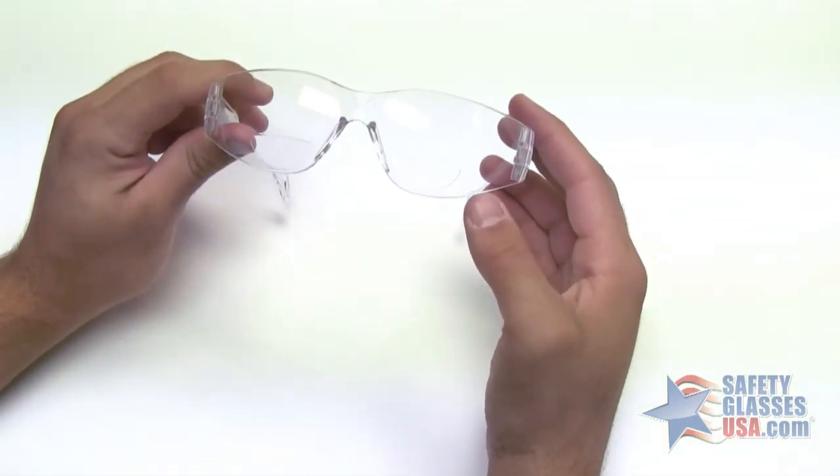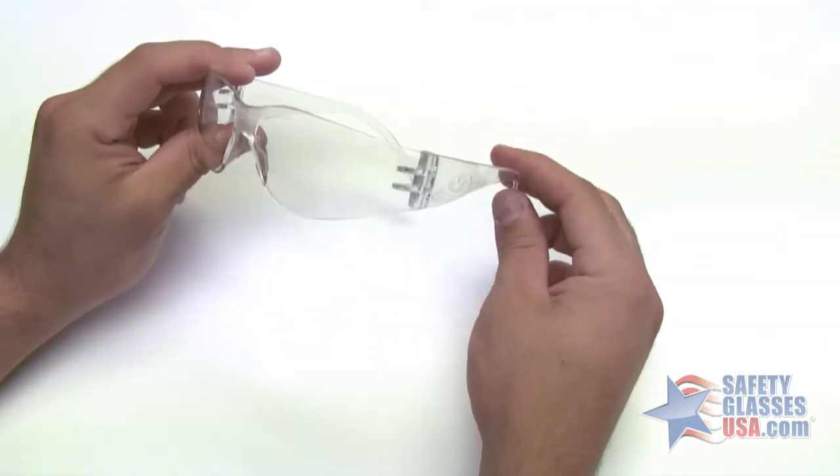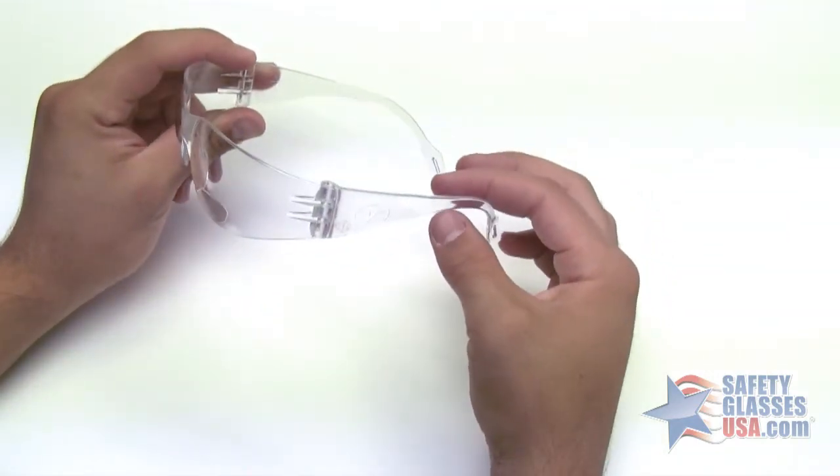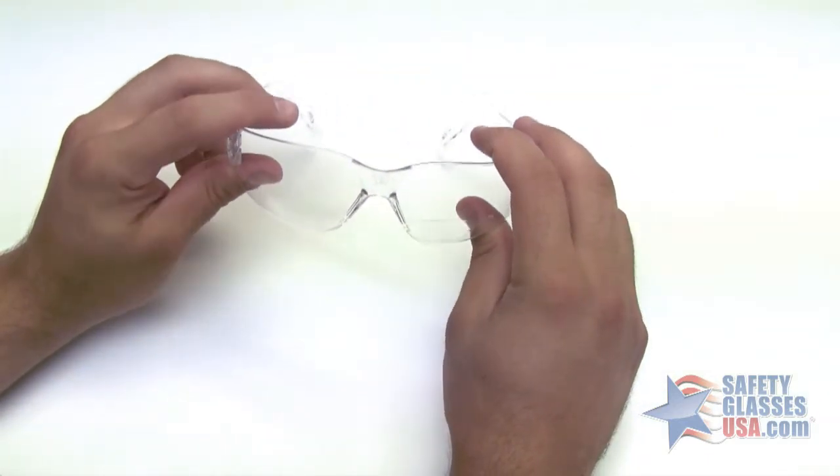This model features bifocals built into the lens. They are a translucent, frameless design of a one-piece polycarbonate. They are also extremely lightweight. They are ANSI Z87 certified.